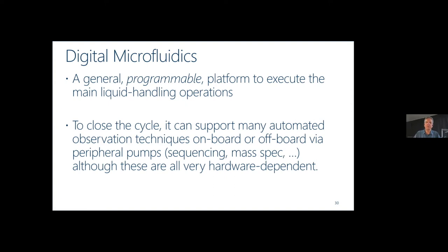So you can inject new droplets from pumps, and you can extract droplets from other pumps. And then you can send these droplets to be analyzed by mass specs or by sequencing, and hopefully you can close the loop and get the analysis of those droplets to cause some synthesis of new DNA, and then the new DNA gets fed back into the microfluidic device and so on. So you can imagine, again, an automated closed cycle system where all is done without touching anything in the lab, just done automatically by the equipment.